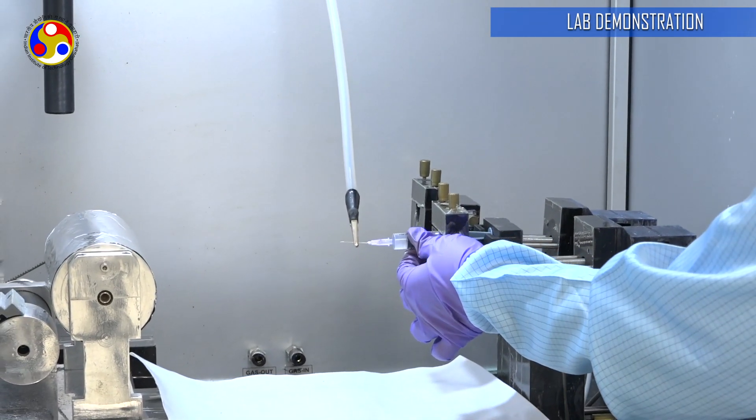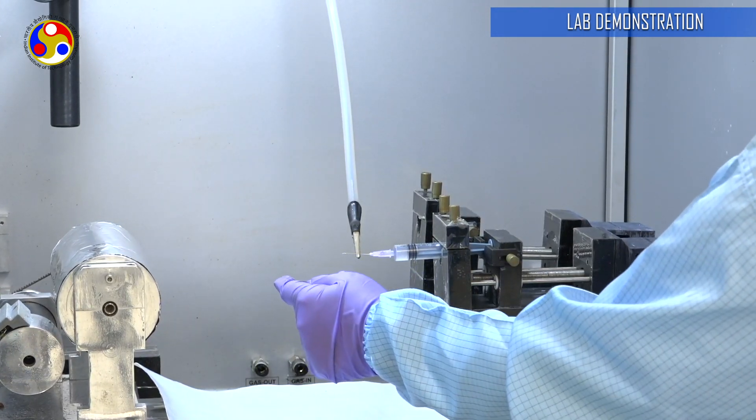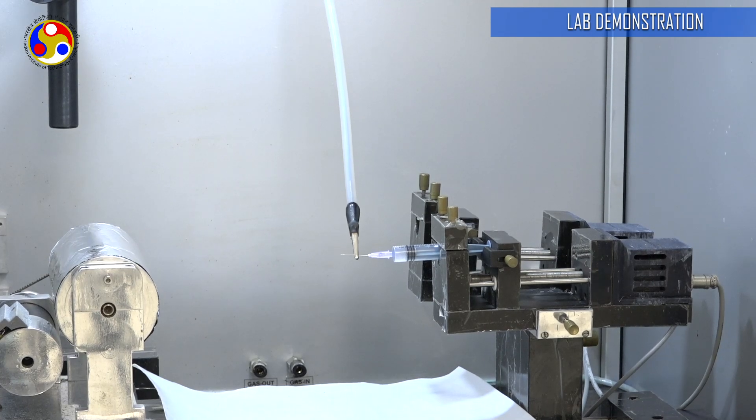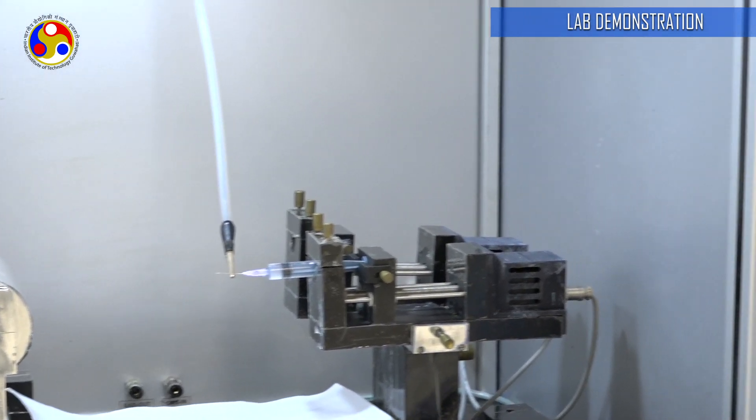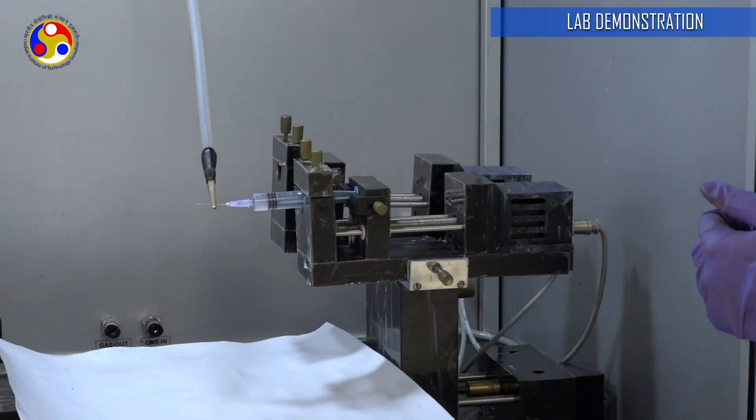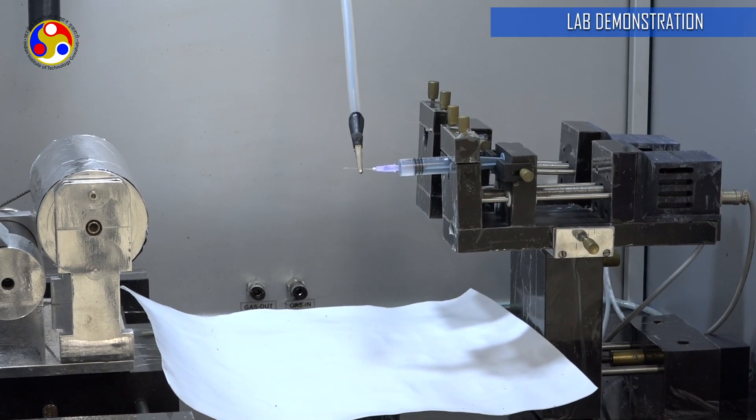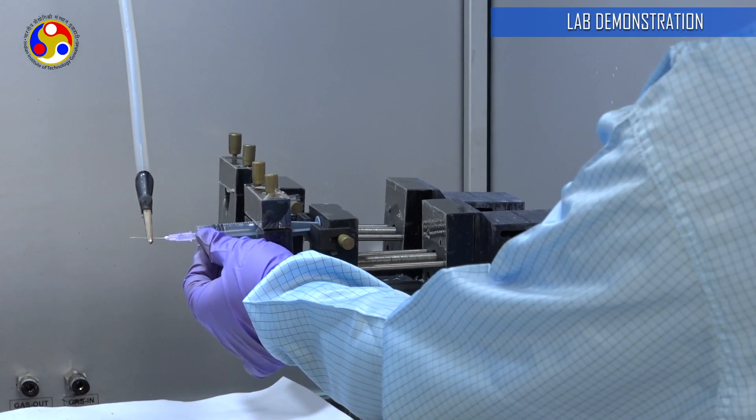One more important parameter is the flow rate of the solution that we are going to pump through the syringe needle. I am going to keep the flow rate at let's say 5 microliters per minute and the volume I want to spin a volume of let's say 1 milliliter. The diameter of this syringe body is 9 millimeters. I am going to just put that here also and press run. It will take approximately 12,000 seconds to spin or release 1 ml of this solution at a flow rate of 5 microliters per minute.